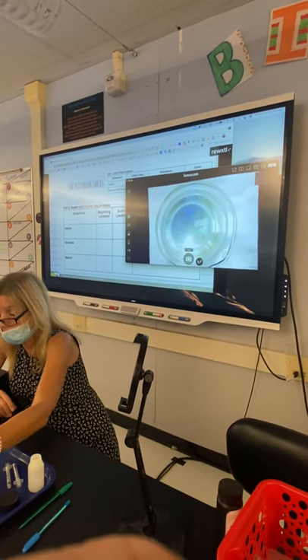So the only thing we need to do is test for glucose. I'm going to take another glucose test strip — this is its initial color. And then I'm going to just put it in the beaker to see if there's any glucose in there. What color do we see? We see green. So is there glucose out in the beaker? Yes. And that's your demo.